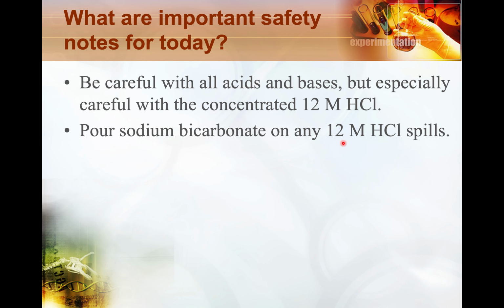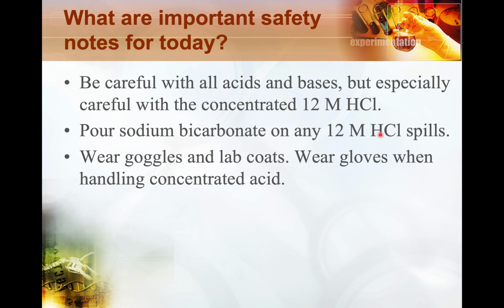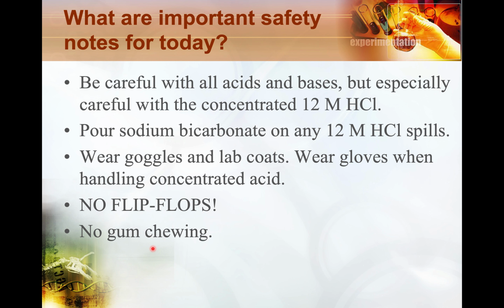If there's any strong acid spills, remember to use sodium bicarbonate to neutralize those to make them safe to pick up and use. Always be wearing goggles and lab coats, and then always wear gloves whenever you're using the concentrated acid solutions. Again, obviously no flip-flops, always closed-toe shoes, wear pants, and again, no gum chewing.